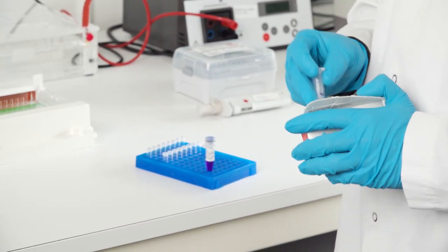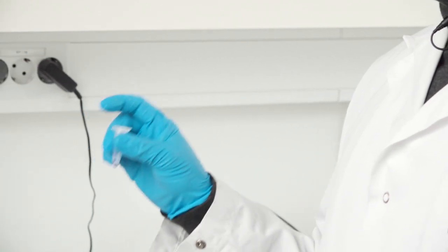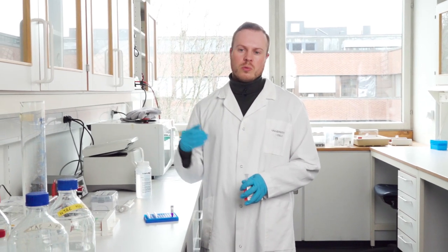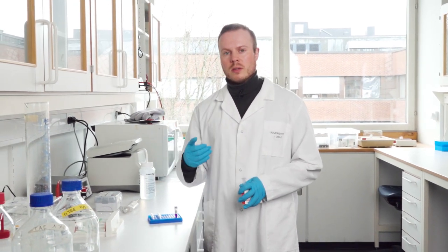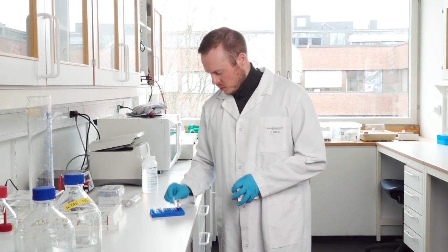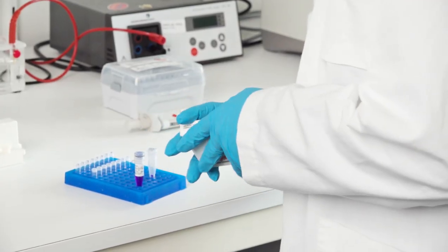The other thing is the ladder and the ladder is a lot of DNA fragments that are 100 base pairs long. One is 100, 200, 300, 400, up to a thousand and this is kind of our measuring device. So this is what we use to compare our samples with to get the proper length or perceive the length of our samples. So this is also something that is needed.